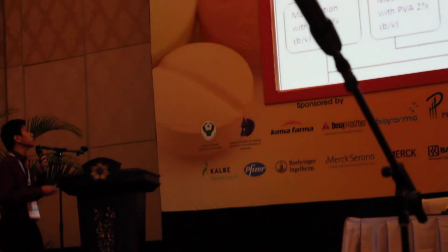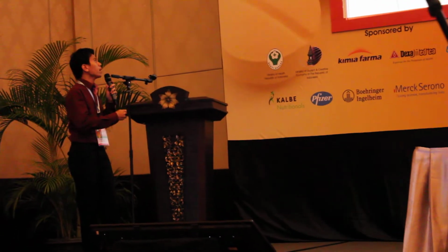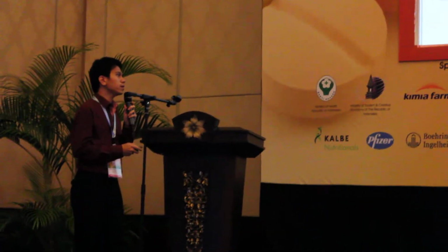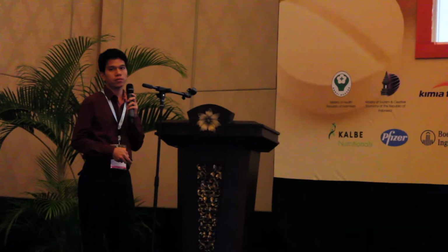Then we do the characterization, check the stability by UV spectrophotometry, and we do the modification with polyvinyl alcohol at different percentages. And then we try it on the analyte solutions, which use lead, mercury, cadmium, zinc, copper, and manganese in 5 milliliter vials.